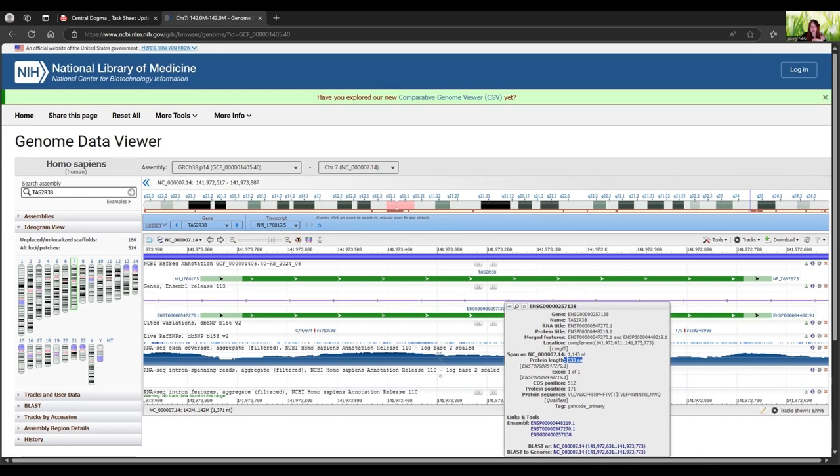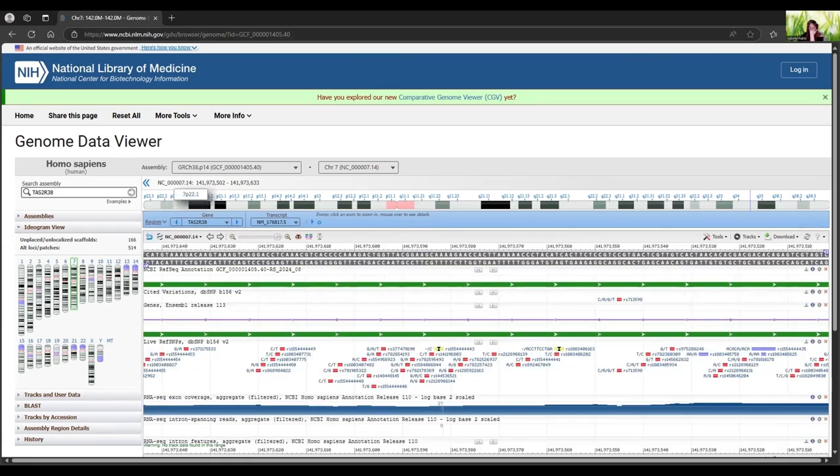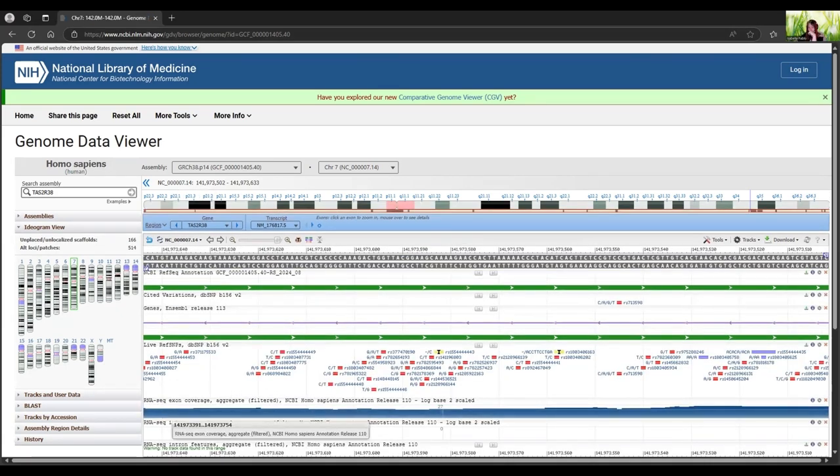All right, so now we're looking at our actual variations. Like I said, there's going to be 3 single nucleotide variations at the respective locations we talked about: 49, 262, and 296. They're actually in order on the program. This is my one located. Okay, I'm starting again for the third time.